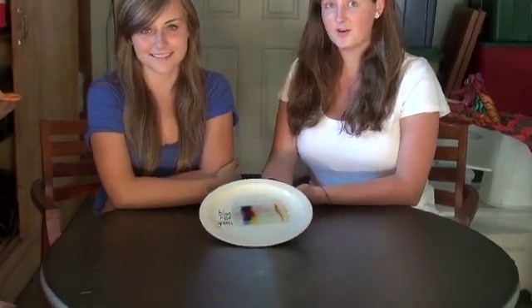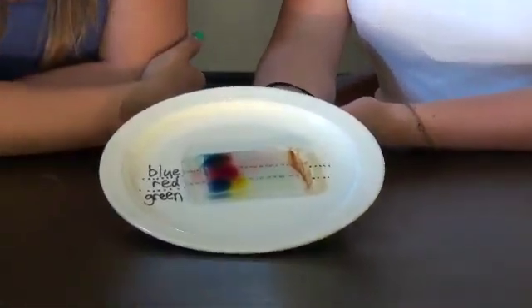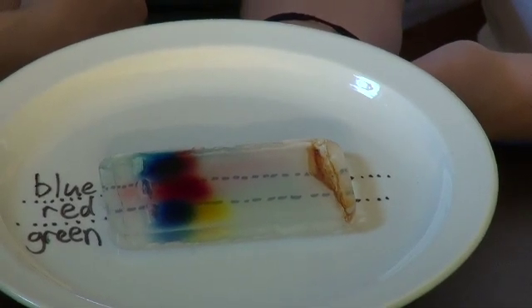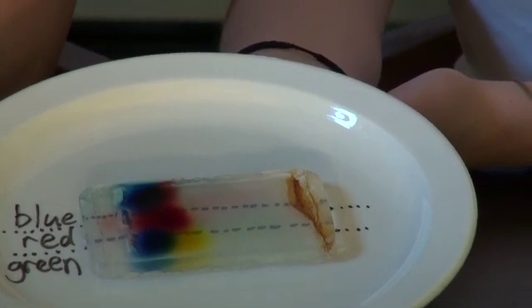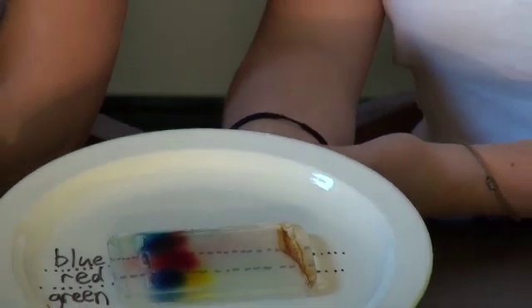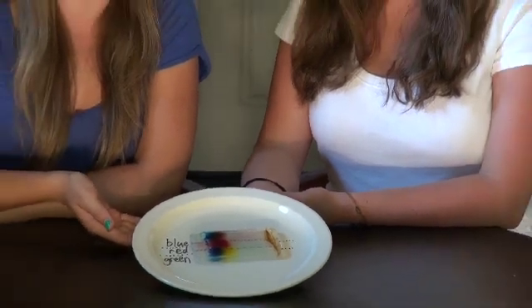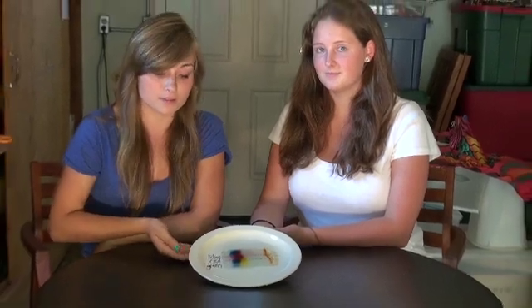So how does all of this relate to DNA? As you can see here in our gel, different colored food dyes separated into different colors after the gel electrophoresis was run. The same process will happen with DNA. Different DNA samples will look different at the end of a gel electrophoresis, because a DNA sample may contain fragments of different sizes, just as these dyes contain macromolecules of different sizes. When they're pulled through an agarose gel with electricity, the results are different because different molecules travel at different speeds.